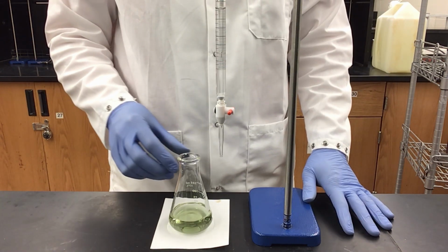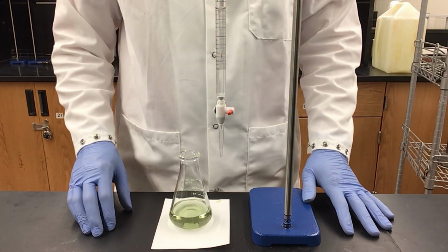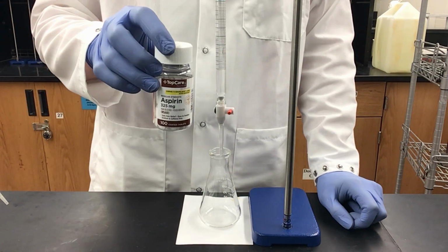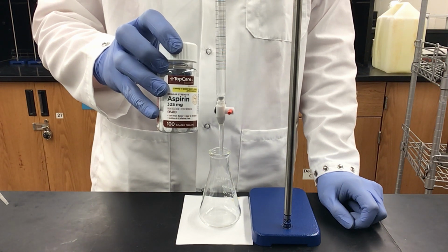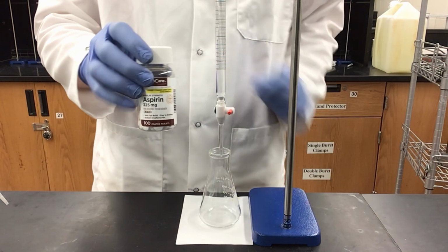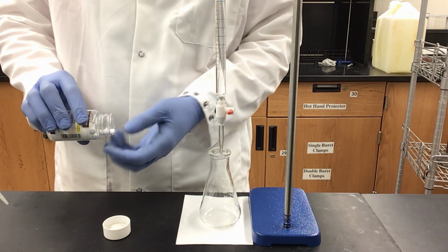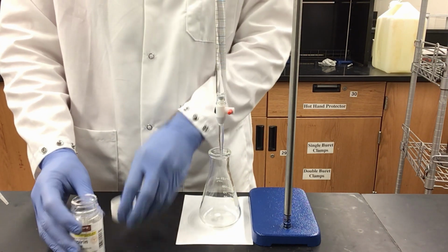We now have everything that we need in order to calculate the true concentration of the acetic acid in our vinegar. Next, we are going to be titrating aspirin to check its acid content. This bottle says that it has 325 milligrams of aspirin per tablet. So I'm going to now take 1 tablet from the bottle and add it directly to my flask.